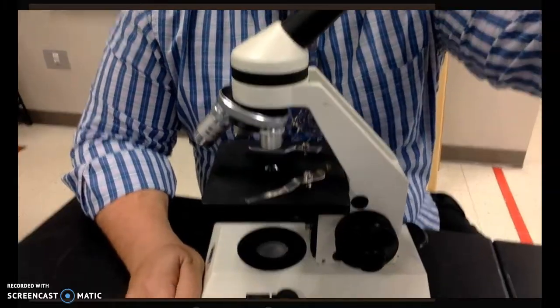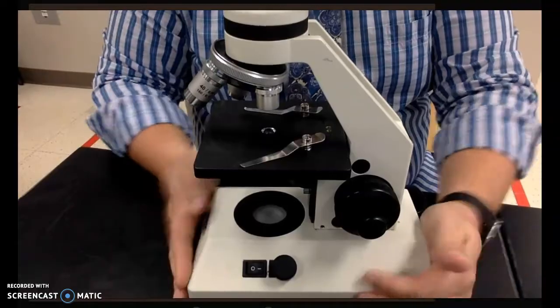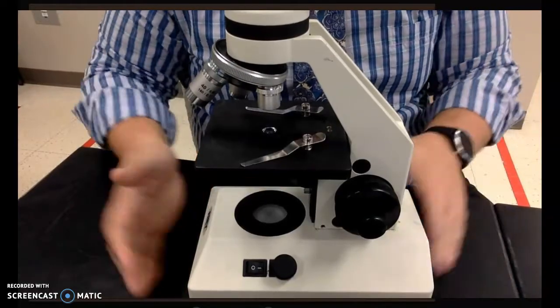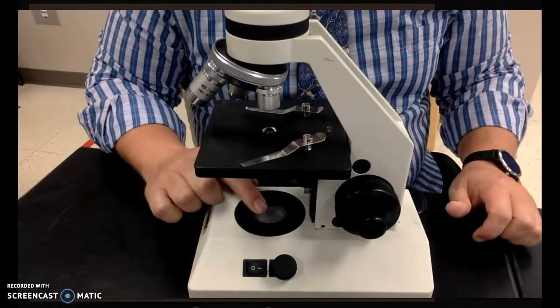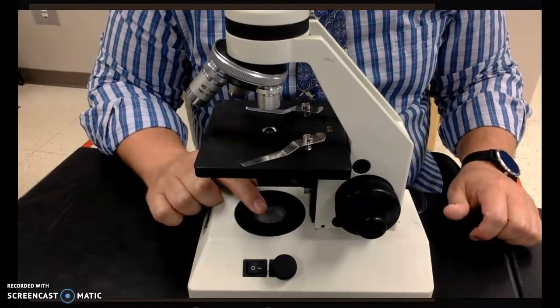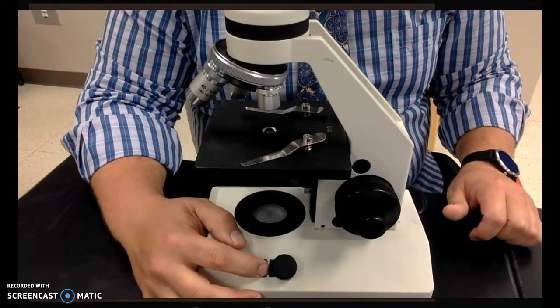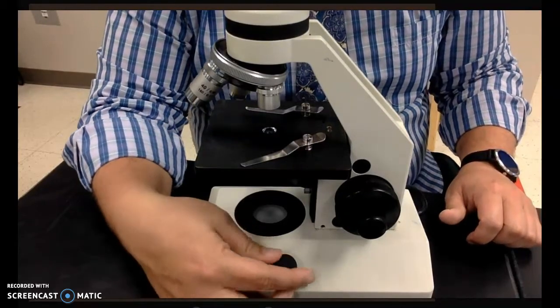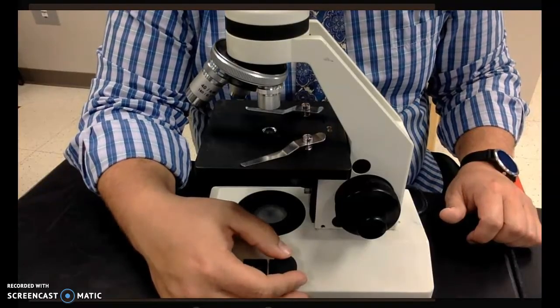Moving on down our microscope, we have what is known as the base. This is what the microscope itself sits on. Inside of the base, there is a lamp. There is an on-off switch. And this knob actually adjusts the brightness of the lamp.